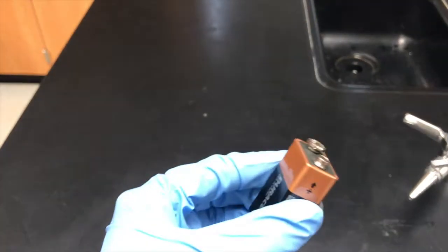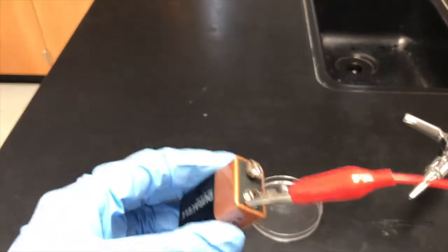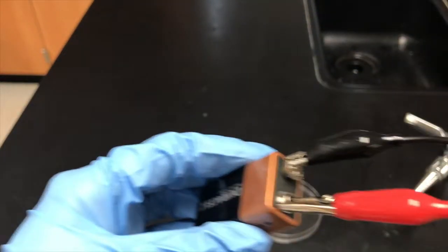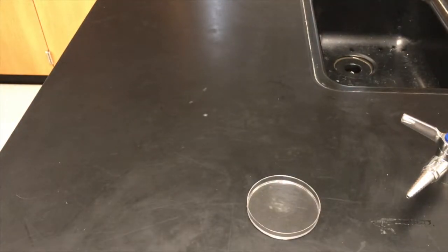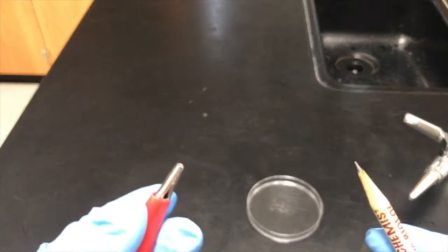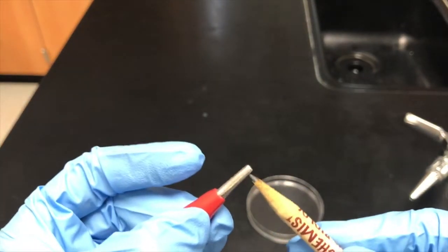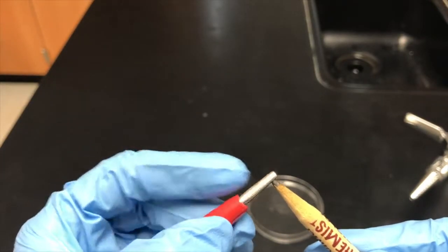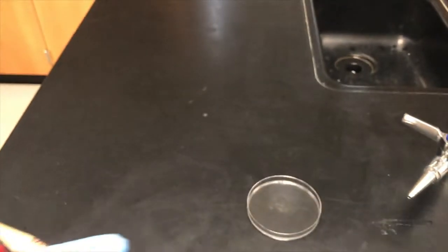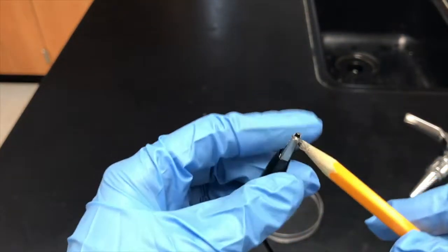So I've got my battery here. I'm going to connect one alligator clip there and one alligator clip there. Now I'm going to connect them to my pencils, to the graphite of the pencils, because while we assume it's just metallic compounds that as solids conduct electricity, graphite, which has covalent network bonding, it's all covalent bonds, that's why diamond is so strong, also conducts electricity. So it's attached there, and then the black one needs to be attached to the other pencil. Now you'll be doing this in the lab with two new solutions and trying to figure out what's going on. All right?